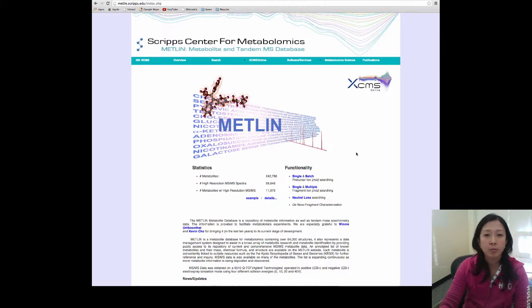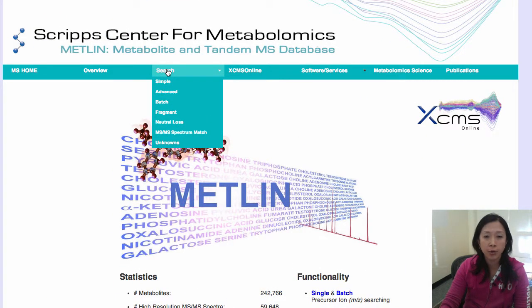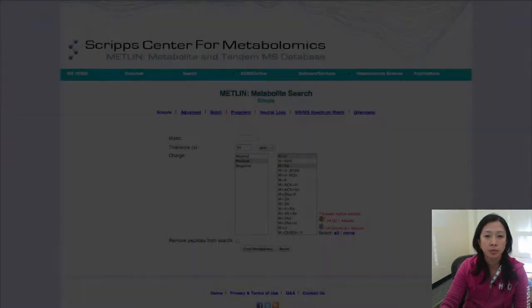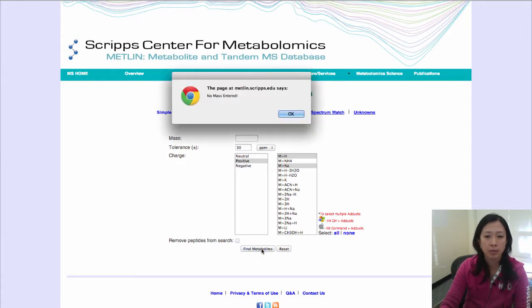Let's explore the search options. If you have an unknown and you only have the mass of the unknown to work with, you can simply go to Simple Search. Over here, you can just type in the mass of the unknown and the mode that it was run, and click Find Metabolite.